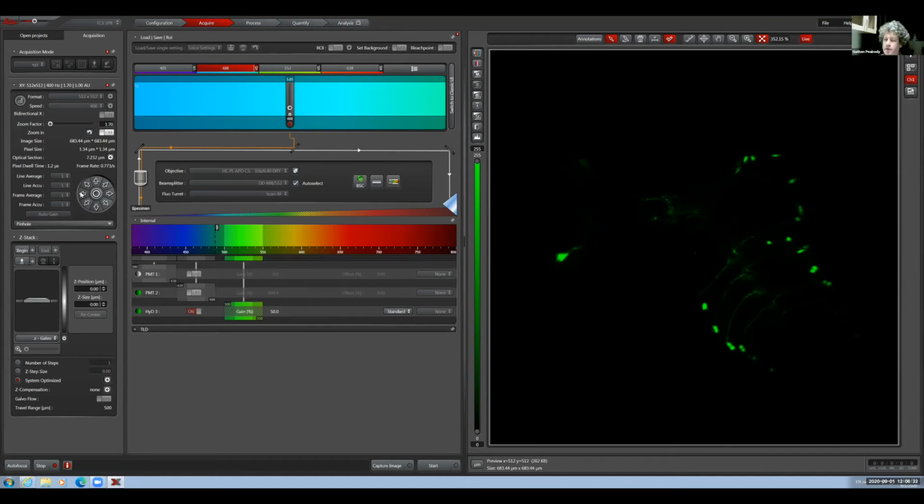Right. Okay. So if you don't mind, let me just sort of recap or extrapolate. The purpose of the zoom is you get to maximize your pixel count for whatever format you're in, which means if you have the objective you want, you've got two choices to zoom in. You can go to a higher objective, or you can be on the objective you're on, like now 10, and just zoom in, and then it maximizes the pixels on that area, which is better than just taking the picture as is and zooming in on software later, because you're losing resolution if you do it that way.